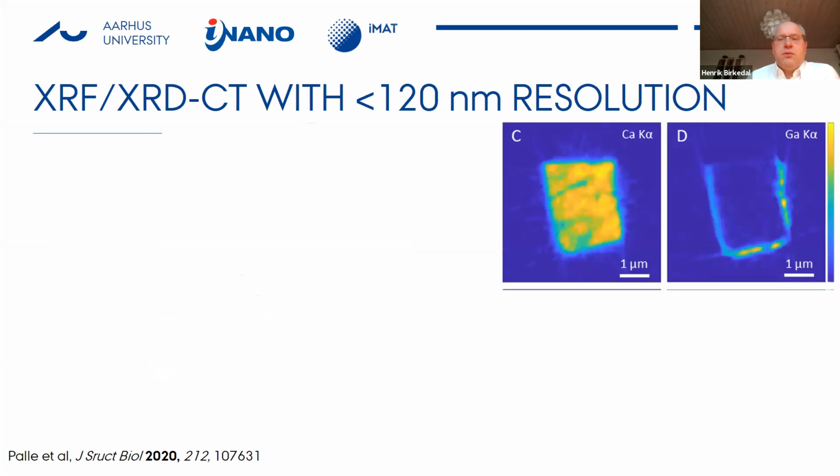And now if we reconstruct this tomographically, I'll show you a slice through the data on the right here, and you can see the void spaces, and we can also see fiducials from the gallium that we. Sorry.